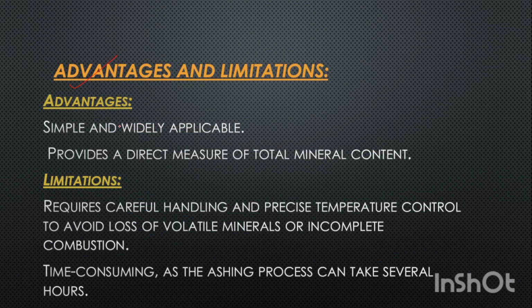Next are the advantages and limitations. Advantages are that it is simple and widely applicable and provides a direct measure of the total mineral content. Limitations are that it requires careful handling and precise temperature control to avoid loss of volatile minerals or incomplete combustion. It is also time consuming, as the ashing process can take several hours.